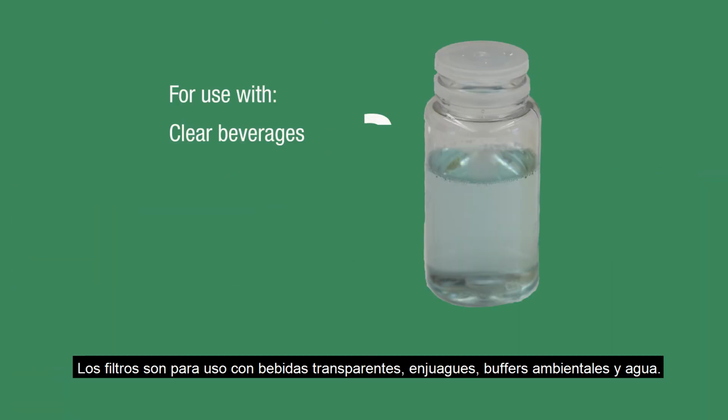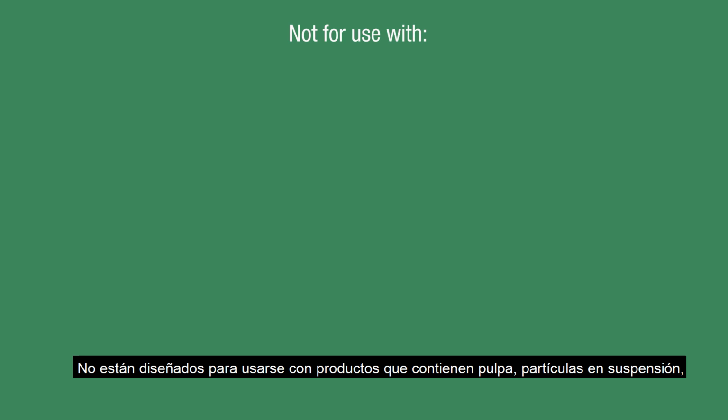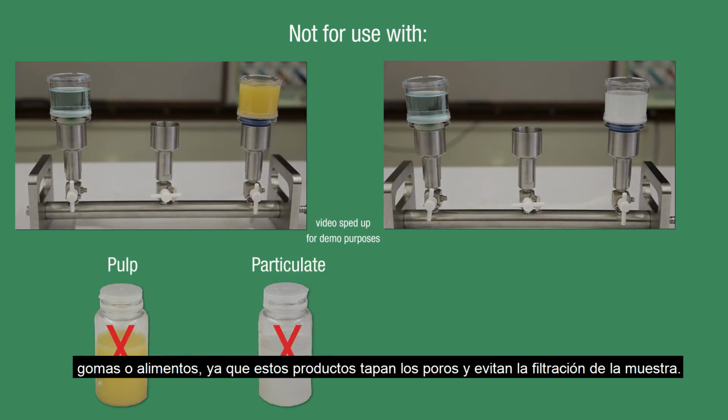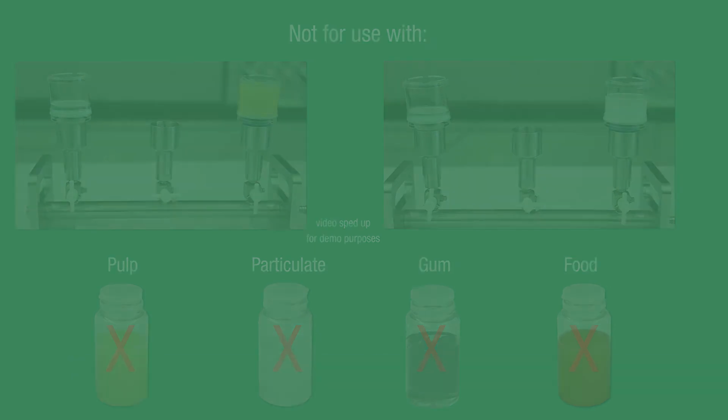Filters are for use with clear beverages, rinses, environmental buffers, and water. They are not intended for use with products containing pulps, suspended particulates, gums, or food, as these products plug the pores and prevent filtration of the sample.